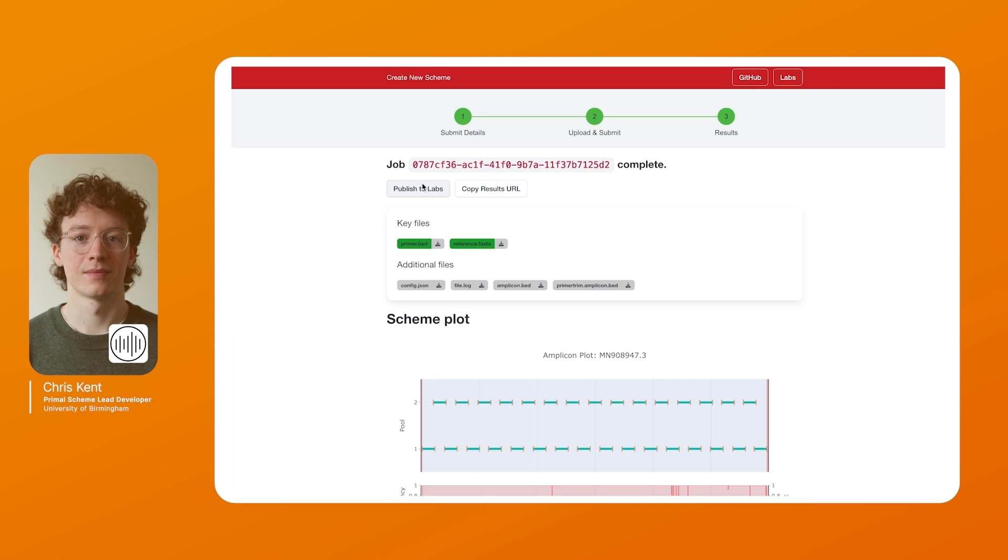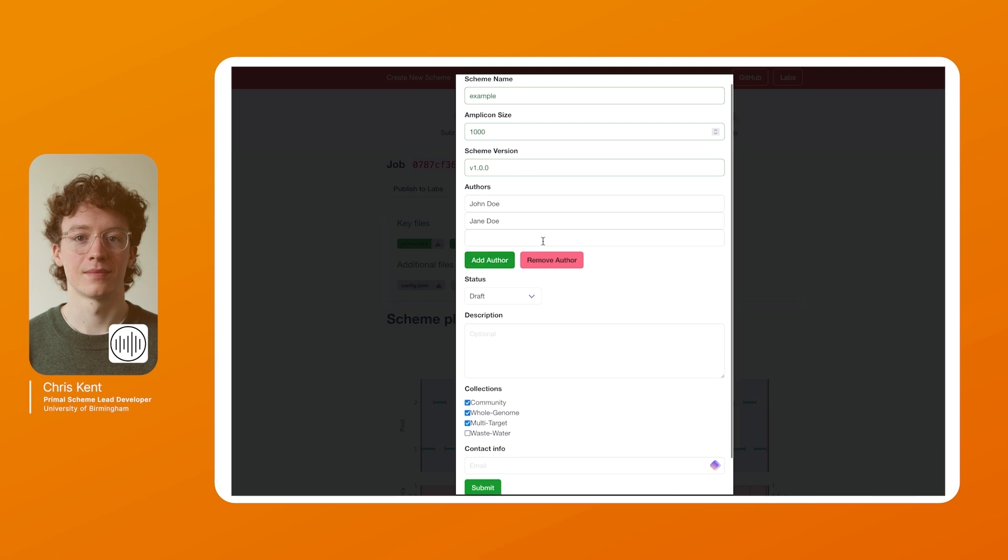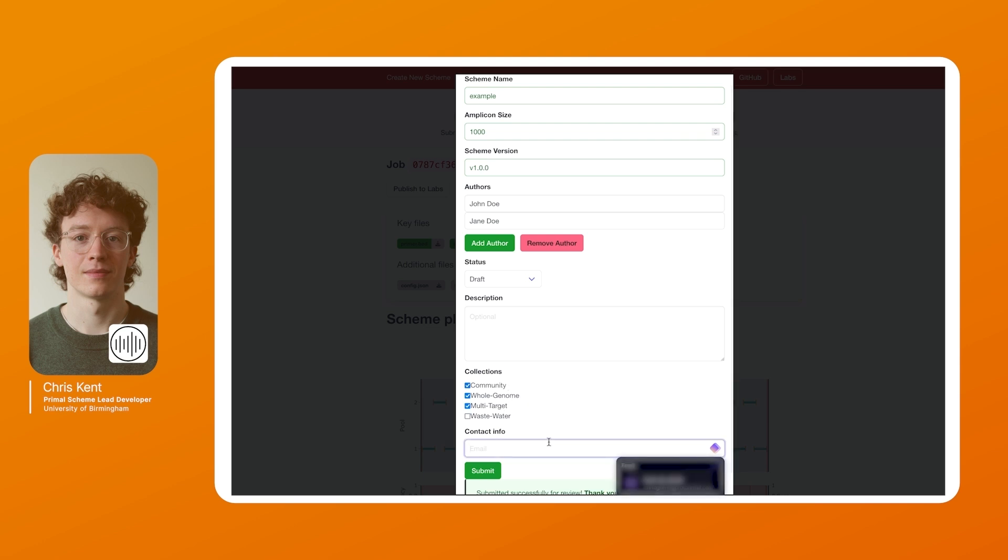Once you're happy with your scheme and you've tested it you can hit the publish to labs button and you can fill out these details such as the scheme name, the amplicon size and the scheme version. You can add and remove authors as needed and you can set a status. Once this is all done you can add an optional description and you can add collection tags such as a community scheme, a whole genome and multi-target. You can provide contact information for us to have any queries and you can submit to labs to be curated and added if it passes.